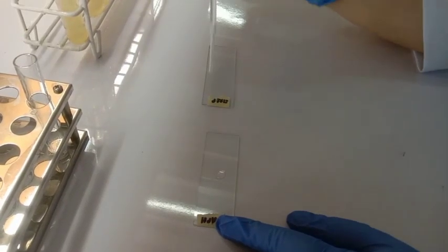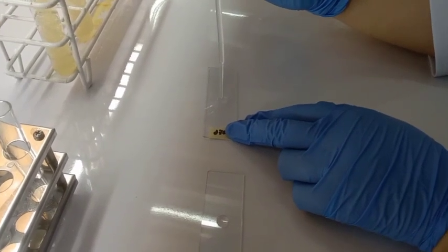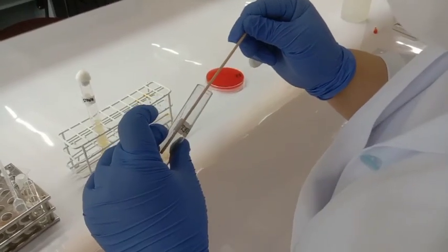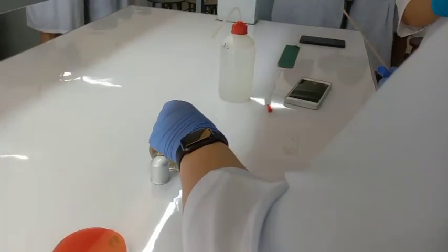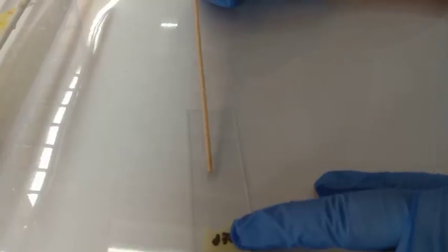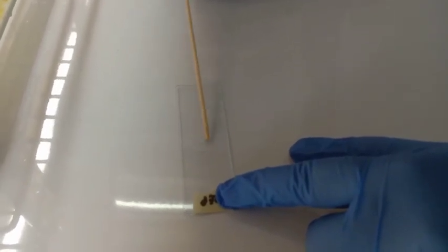Label each glass slide and pour 1 drop of 3% hydrogen peroxide solution. Using aseptic technique, get the colonies from each organism and emulsify a colony separately using an applicator stick in 1 drop of hydrogen peroxide. After that, observe for effervescence or bubble formation.